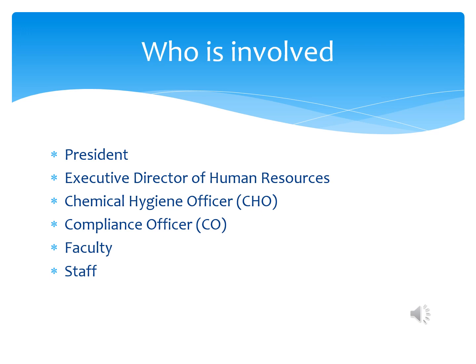Faculty are responsible for instructing students in the lab about safe lab practices and enforcing these practices. Lab staff need to follow safety practices and alert others in the lab when these practices are not being performed. Non-lab staff need to be aware of their surroundings while working in laboratories and follow safe lab practices.